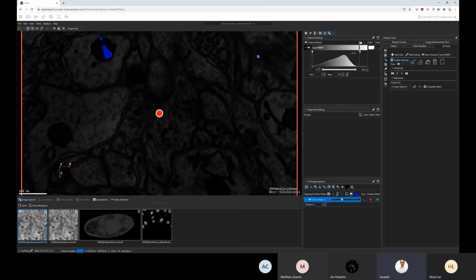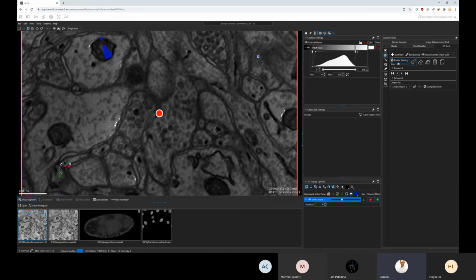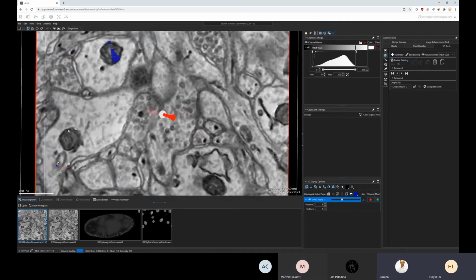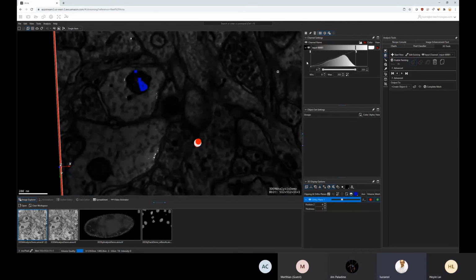Yeah, so like this, now adjust. Well, that looks weird. Check the bottom left. I think the bottom left sphere is probably not actually at the bottom. I'm actually in the middle slice right now. No, I mean on the lookup table there are 3 little dots, spheres, that control the opacity. The one you created is fine, but the further one on the left, I don't know if it's actually at the 0 at the bottom. Yeah, I don't know either. But can you pick it up and drop it back to the bottom just to make sure that it is there? Because I think the display looks a bit odd.